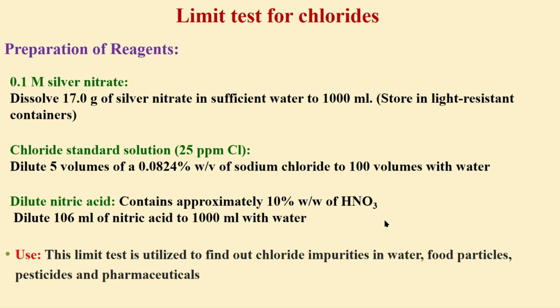When we use tap water, definitely it gives opalescence. That's why care should be taken that we use deionized water for carrying out this test.